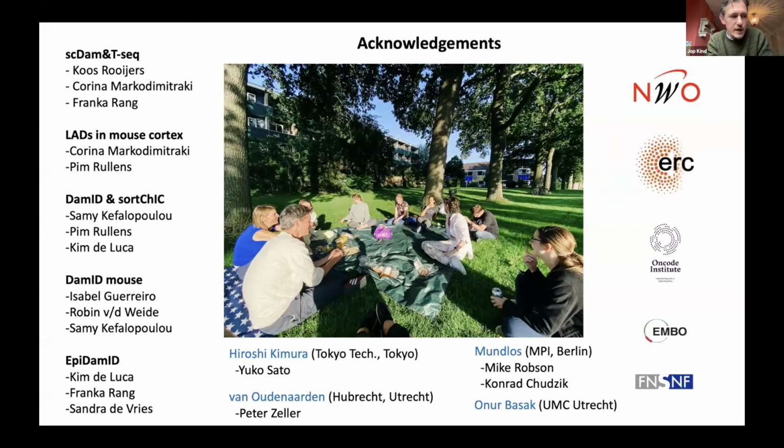Yeah, we haven't necessarily looked at the live cell imaging with this method. So that's kind of the microscopy version of the DamID, where we can illuminate the methylation events as they occur in a cell. I don't think we have done live imaging, but we've done super resolution imaging, and structurally it looks the same as in other cell types. It doesn't look necessarily more dynamic or more decondensed than what you observe in more differentiated cell types. But we haven't done any live imaging of this.